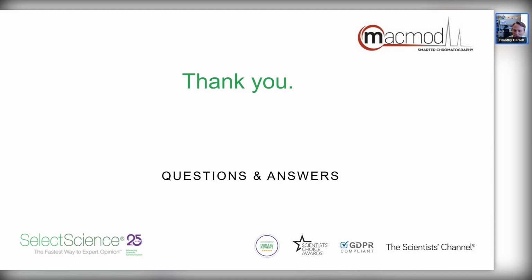Yeah, I don't necessarily know exact evidence for this, but I think it's partly because you have less of those gaps, less spaces between particles. You have more effective particles in the column, and so you have more interactions that those analytes will have with the particle phases, and so you're going to extend that retention time, especially for really polar analytes that have maybe less interactions, and you're adding additional retention against particles that are more tightly packed.